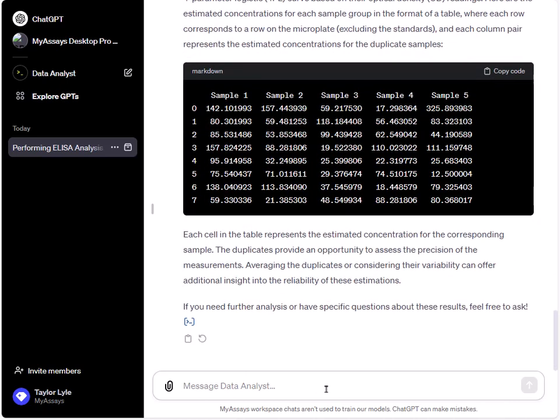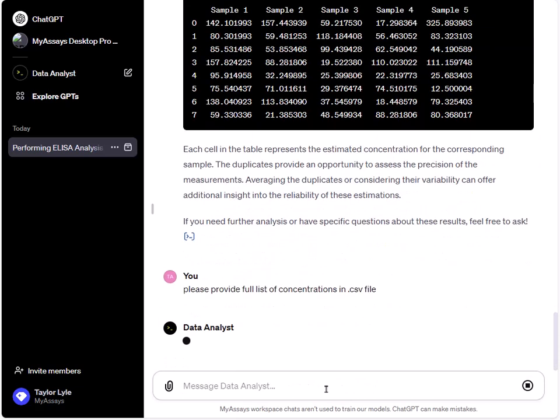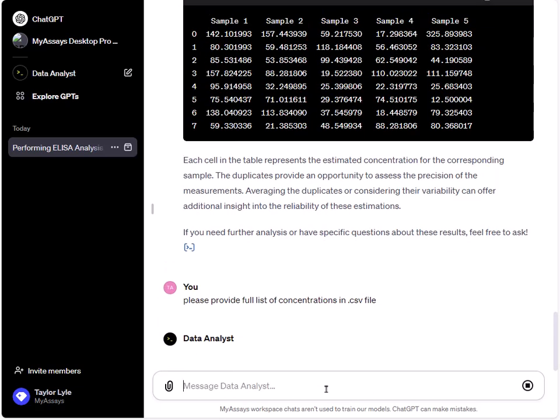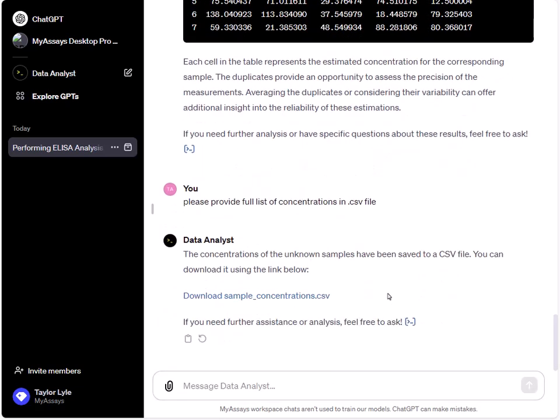So the concentrations of our unknown samples have now been calculated and I'll request the full list of calculated concentrations in a CSV file. So now you can see an option appears here allowing us to download the CSV file containing the unknown average absorbance and calculated concentrations.